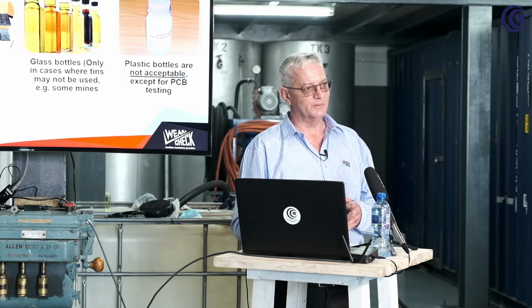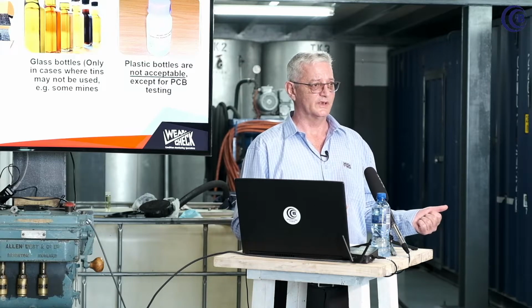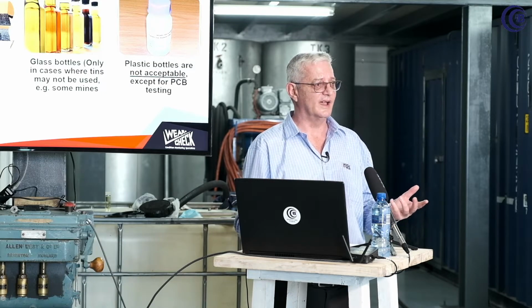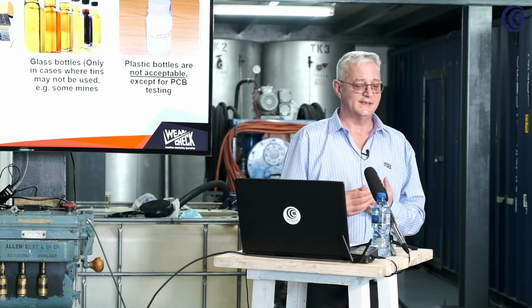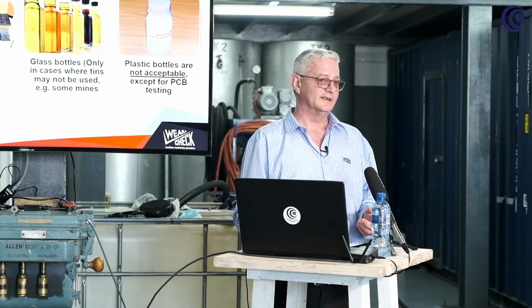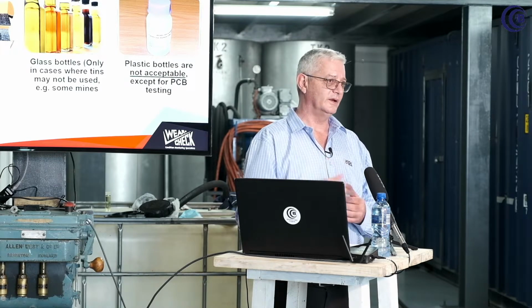If it's not in the correct sampling container, we get a lot of, for example, 2 liter Coke bottles. Firstly, your gases are out of those, especially hydrogen. That's the first gas that goes out. So immediately the gases are out, and depending on the ratio, the rest is going. Secondly, I've never in 30 years tested a Coke bottle which passed on moisture. We are testing in parts per million. People think if they clean that Coke bottle, it's clean. It's not. That water is absorbed in the plastic. You can't get it out, and it will fail. So it's going to cost you money. Spend that 30 or 34 rand, buy the correct sampling container, and get the correct results.